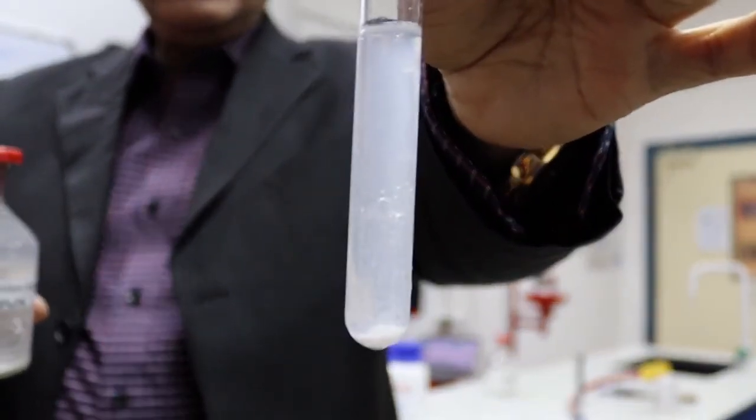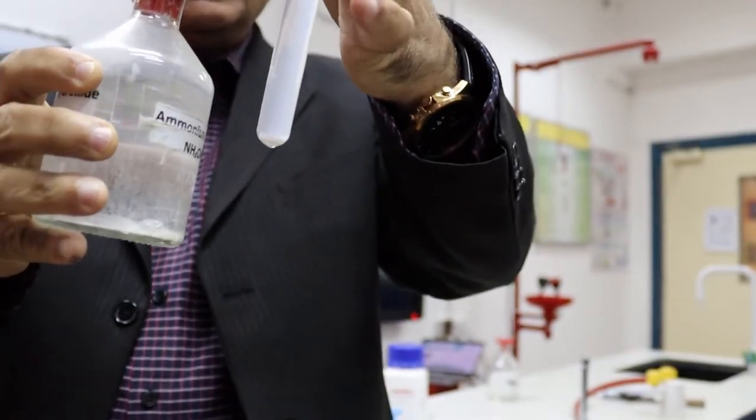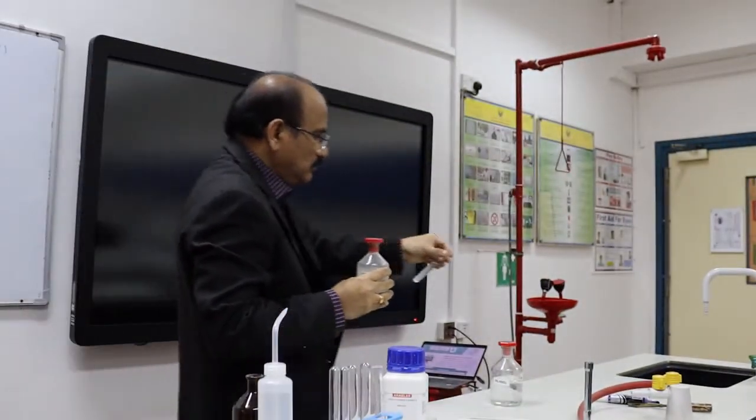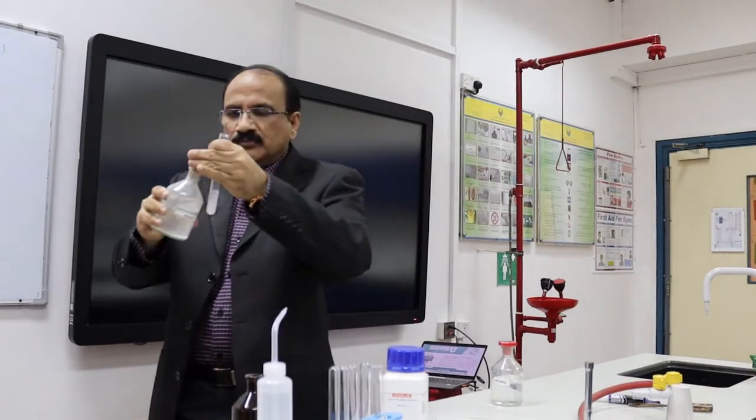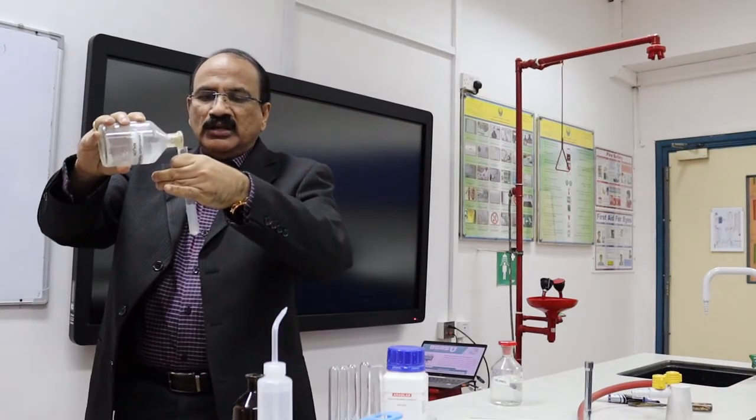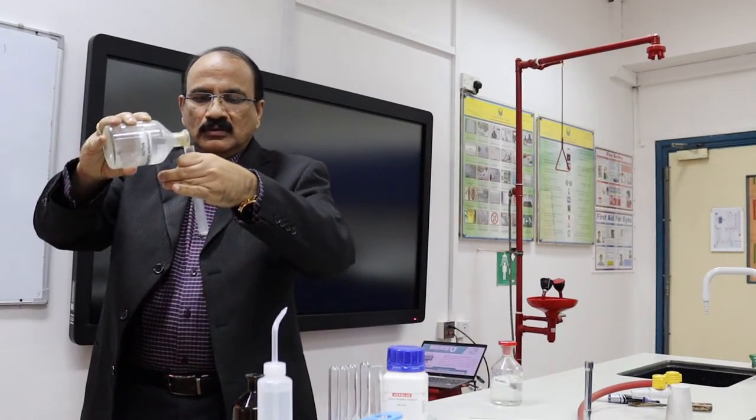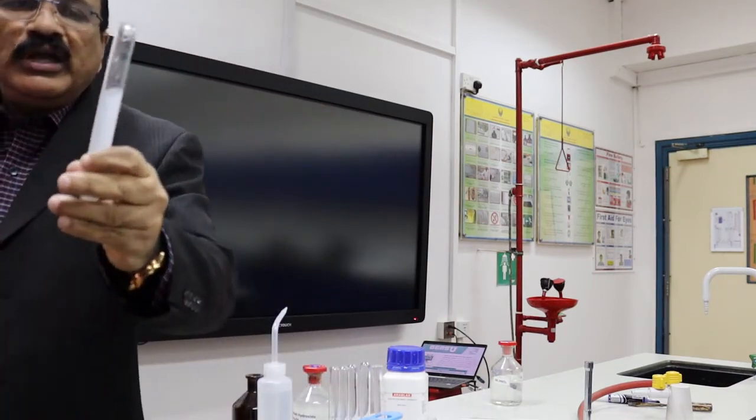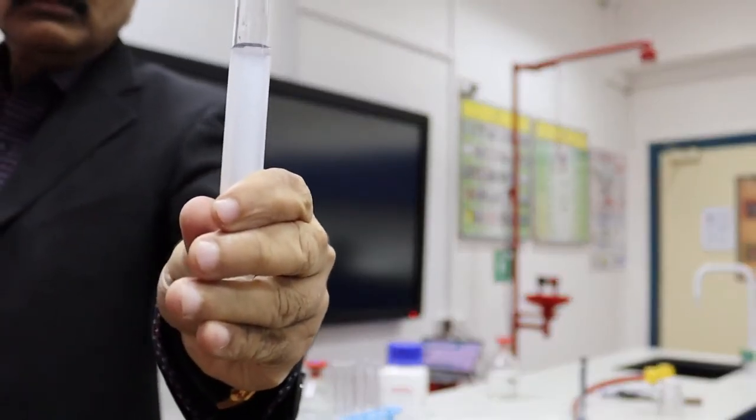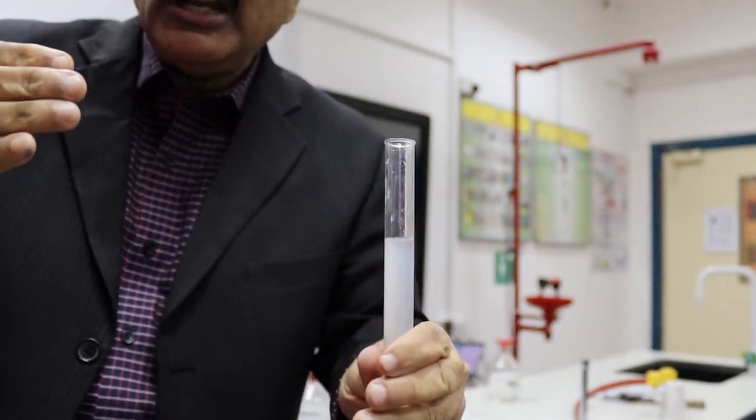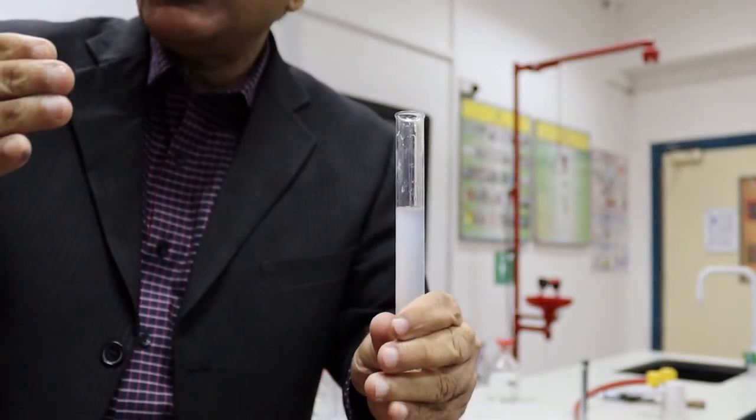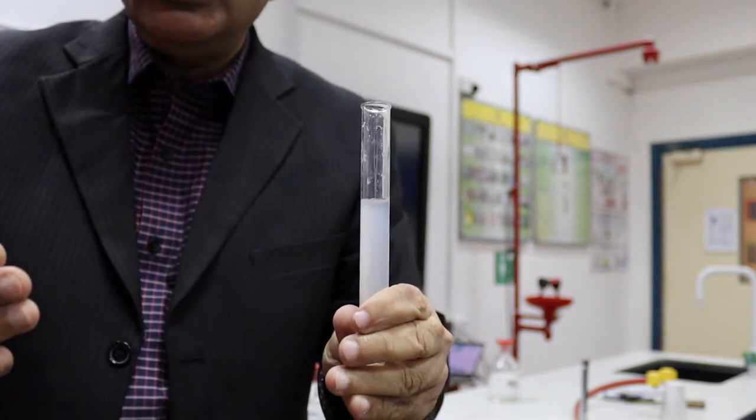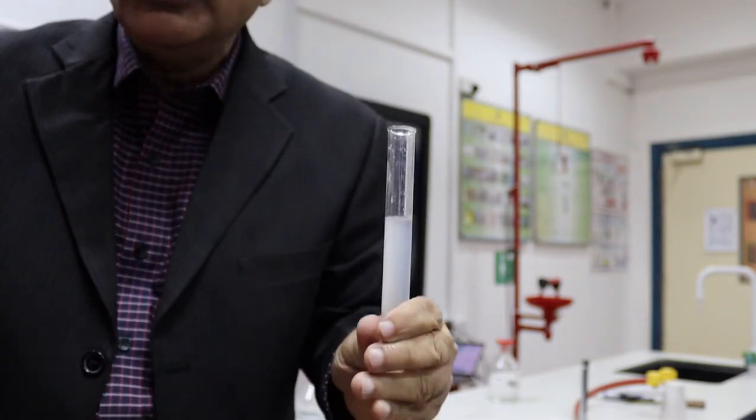So precipitate is getting dissolved. If you add more ammonium hydroxide, the precipitate will completely vanish. So this is ammonium hydroxide. You can see the clear solution now. You can see the clear solution. So white curdy precipitate is soluble in excess of ammonium hydroxide. That's a confirmatory test of chloride ion.